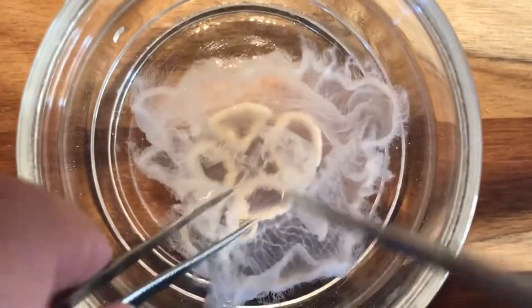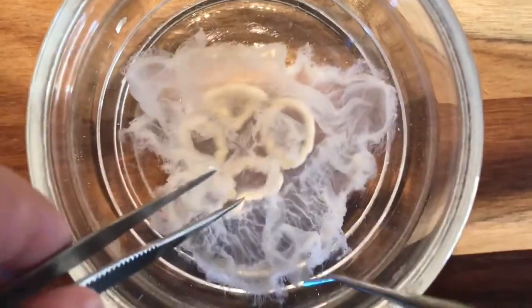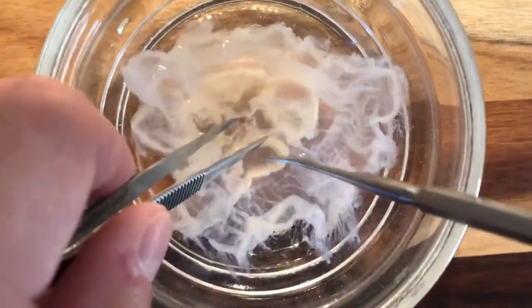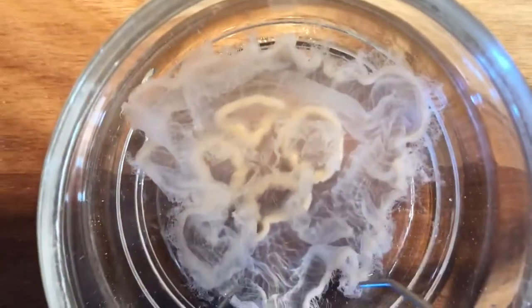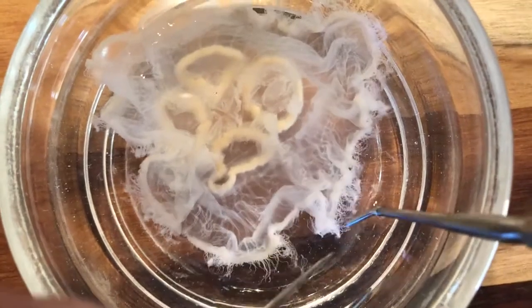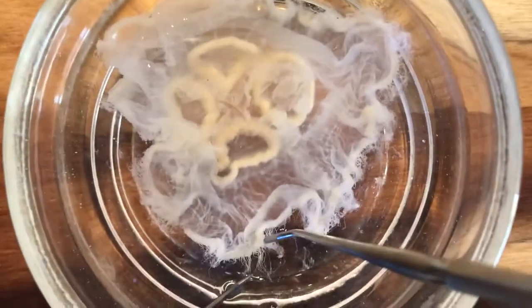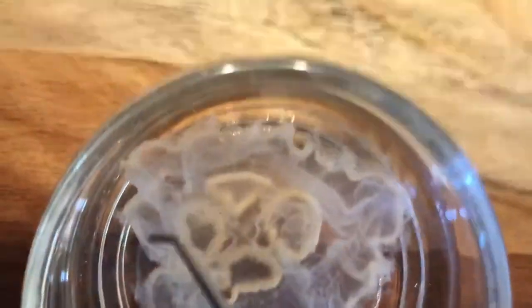Coming from the gastrovascular cavity along through the umbrella of the body is the radial canal, which sends nutrients out to the ring canal. The ring canal is this thicker tissue all along the margin of the umbrella, and it goes all the way around the umbrella.